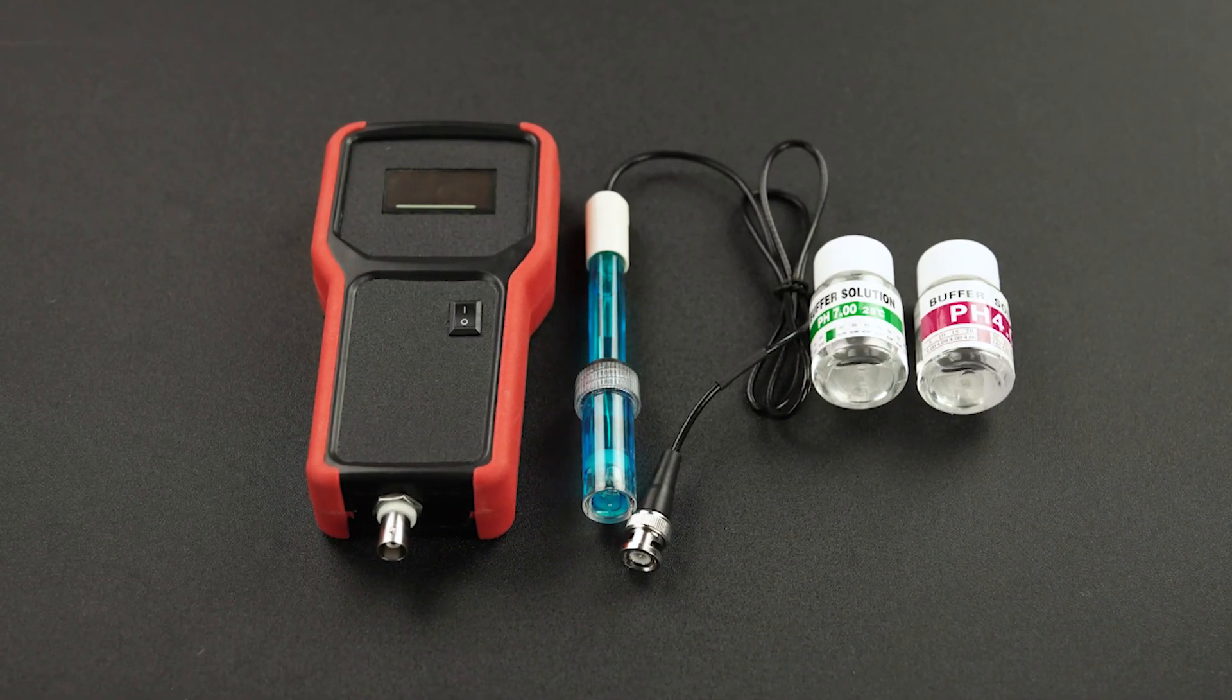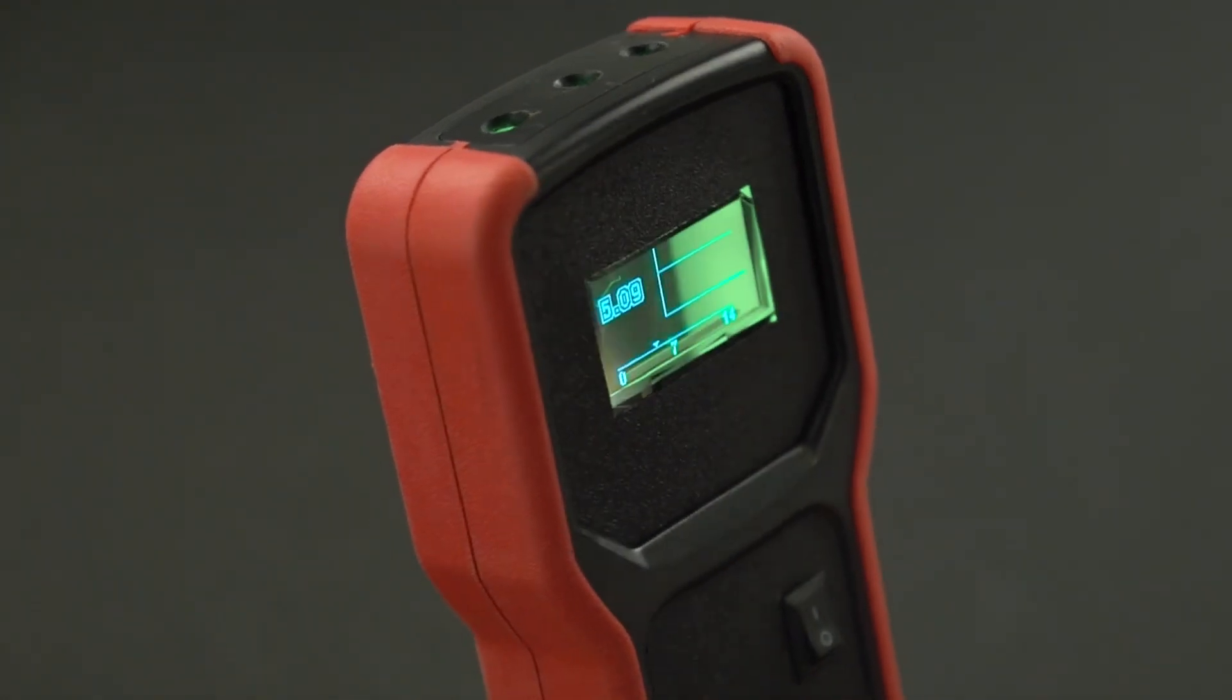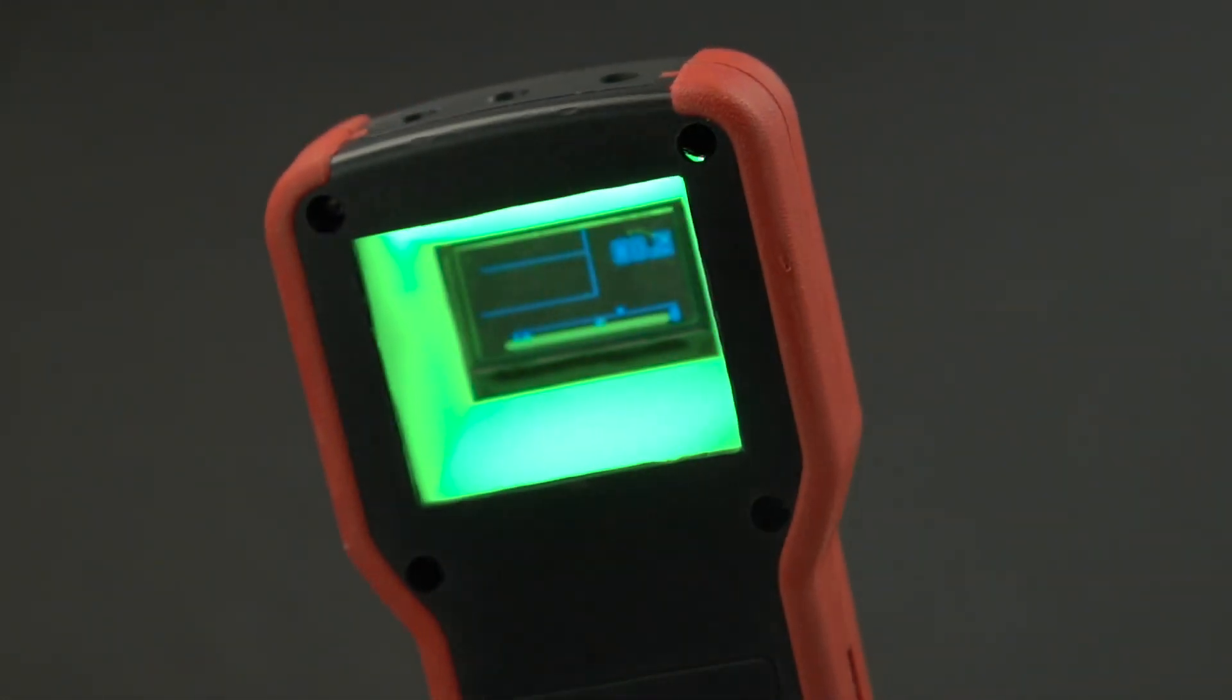In this video, we will talk about the principle of pH calibration. Thanks for all the likes on our videos. Your support is the greatest power for us to make more videos.